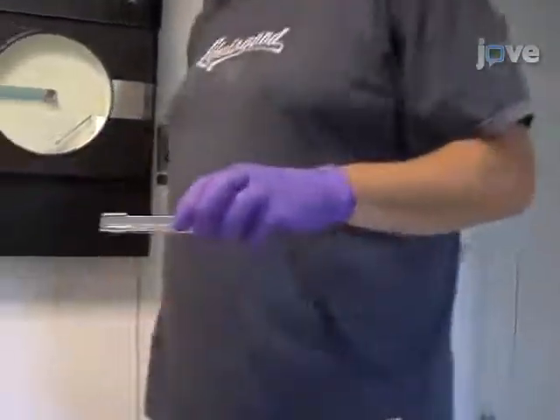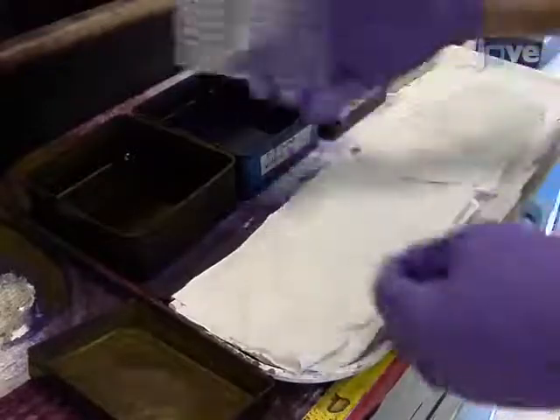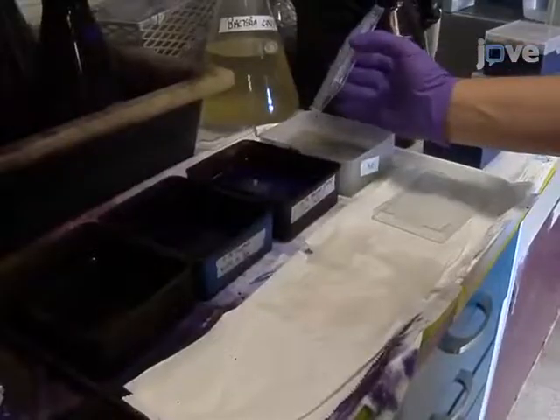Once the biofilms have formed, remove the plate from the incubator and discard the culture supernatants by inverting the plate and shaking out the liquid. Then gently submerge the plate in a small tub of water to wash off any remaining unbound cells or medium components that may cause background staining. Shake out the water, blot the plate, and repeat the wash.